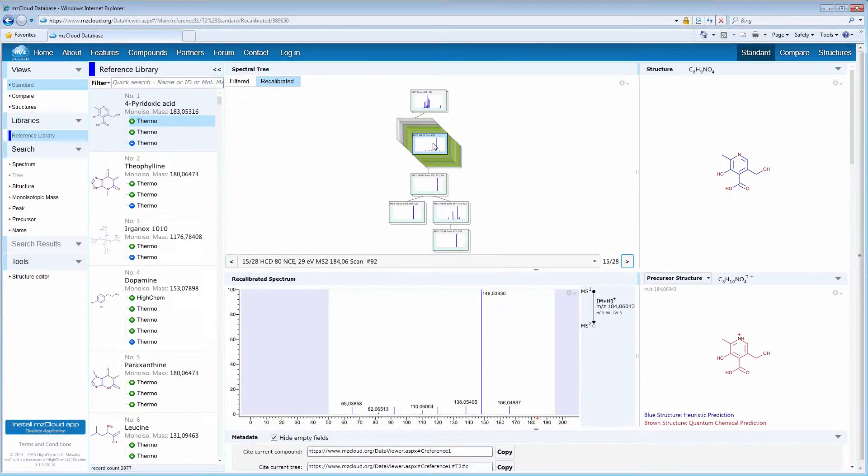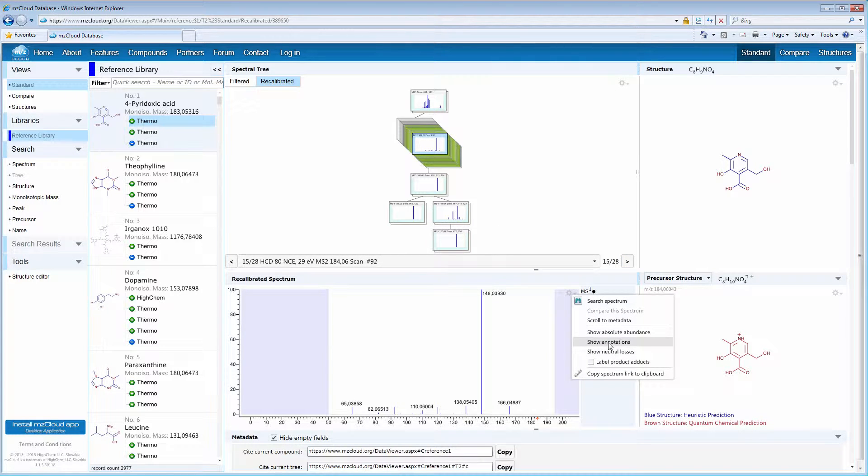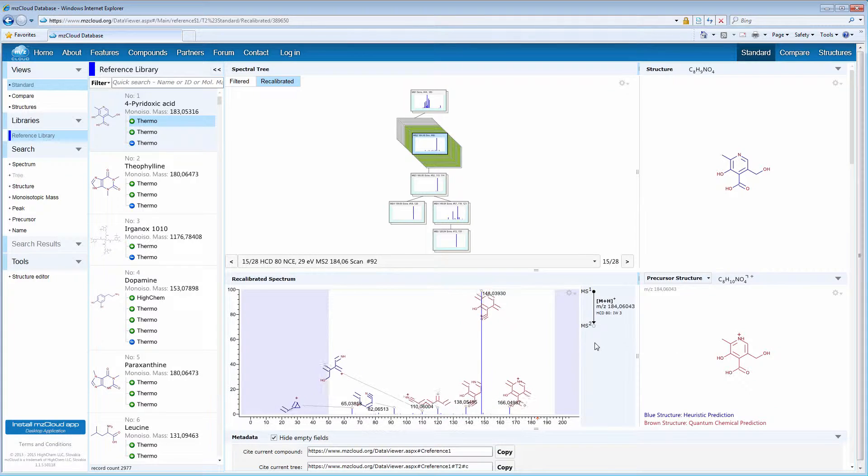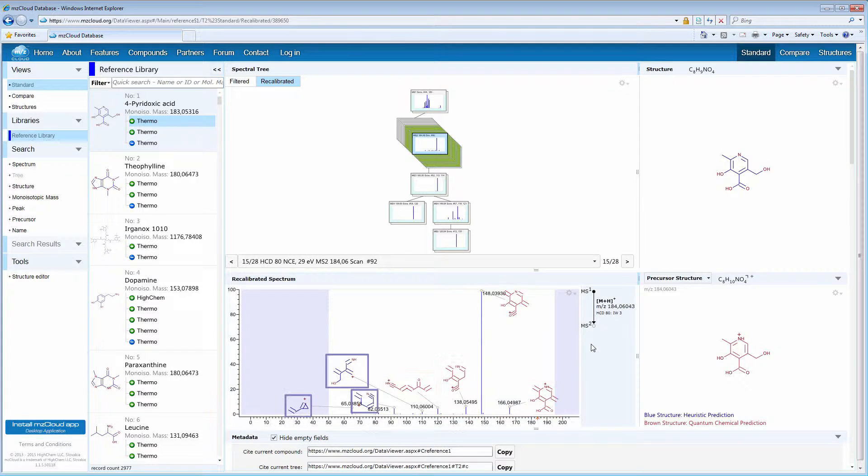What is really nice in MZCloud is the option to display fragment structures corresponding to peaks in the spectrum. Here we have quantum chemically calculated fragments that are shown in brown, and heuristically predicted fragments that are shown in blue.